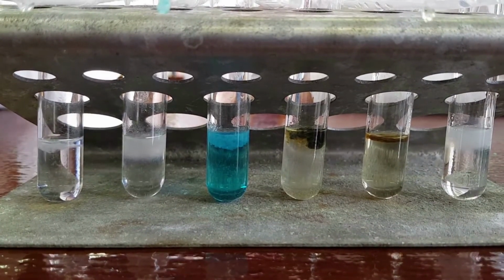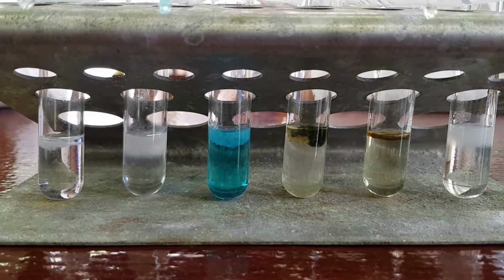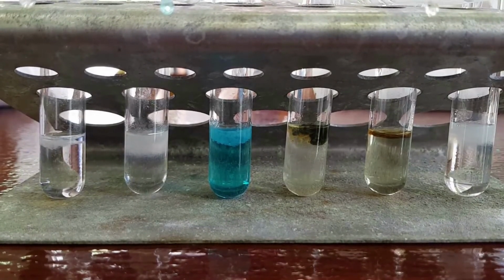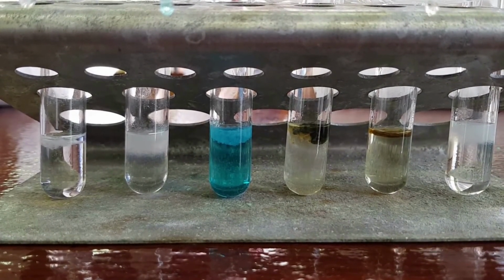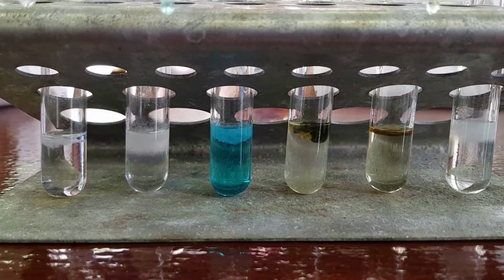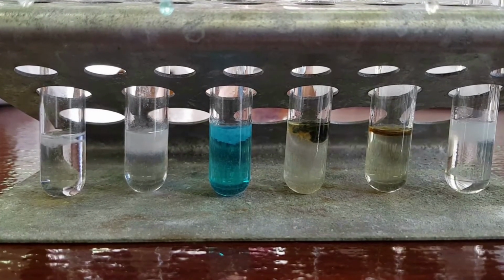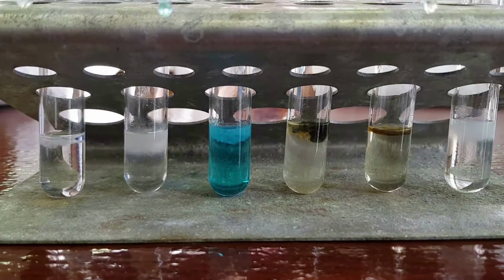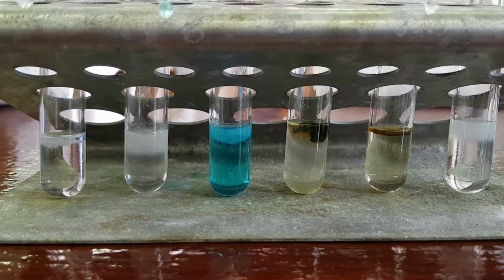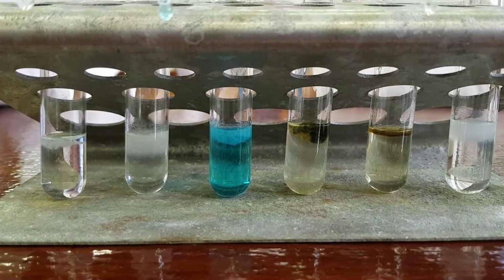So the copper is easy to identify, pale blue precipitate, iron 2, dark green precipitate, and iron 3 as the brown precipitate. But between the aluminium, the calcium and the magnesium, they are all forming white precipitates. So we need to be able to distinguish between those three. One of these three solutions can be identified via a flame test, as you've seen previously, so have a think about which one that is. However, there is another test we can do to distinguish between these three white precipitates.